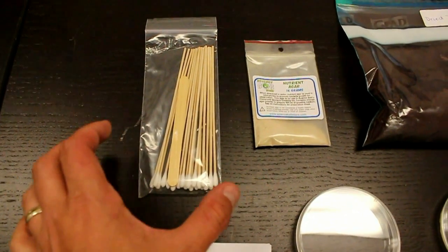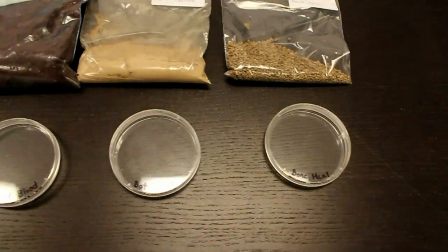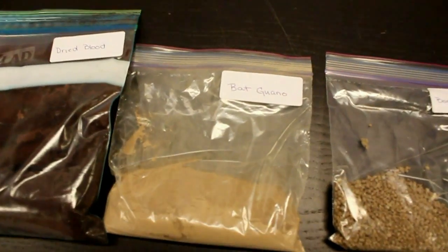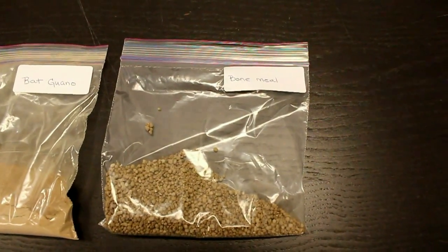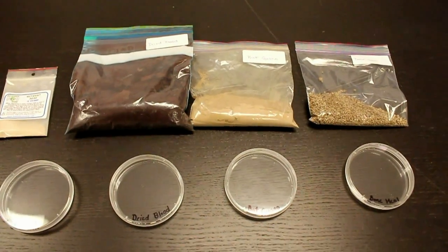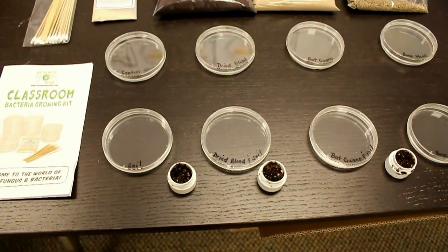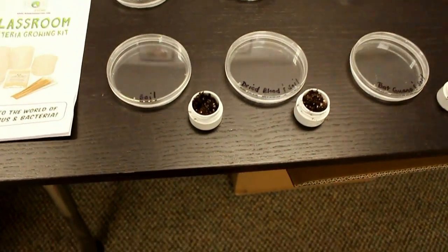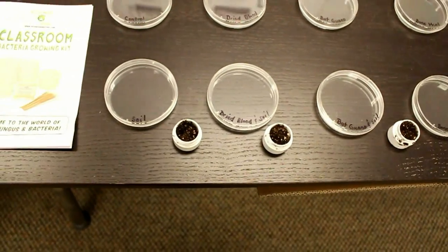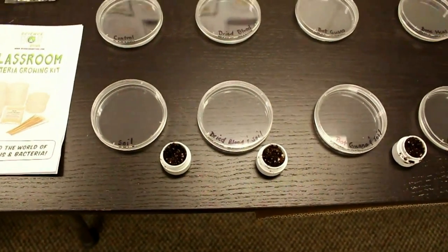All of our materials have been sanitized and have not been touched by anyone, including these petri dishes. The three organic substances we're going to be testing are dried blood, bat guano, and bone meal. What I want to test is whether it's actually the fertilizer that's causing the bad bacteria to grow, or whether there's bad bacteria present in soil and it's the fertilizer causing it to multiply. I've taken soil samples from the same source — a planter placed outside our office, exposed to the wind and external factors.